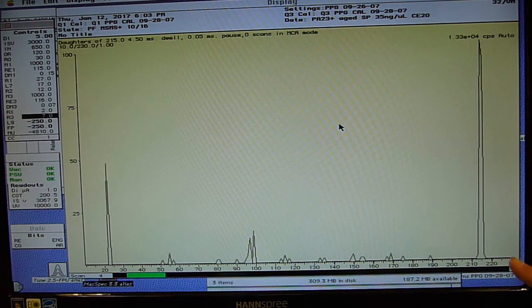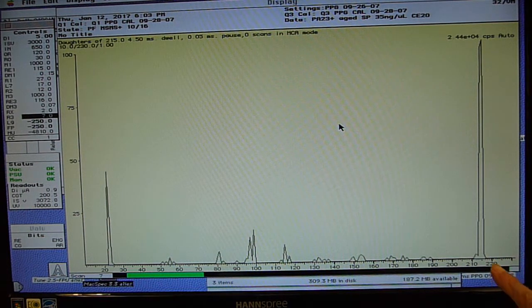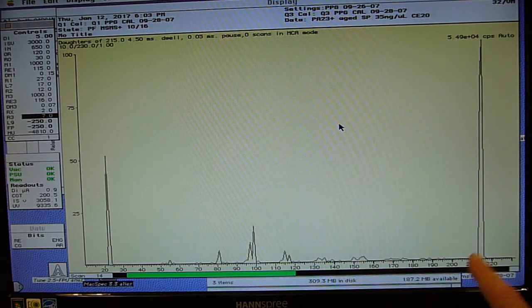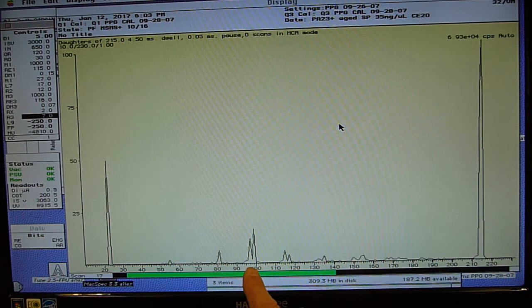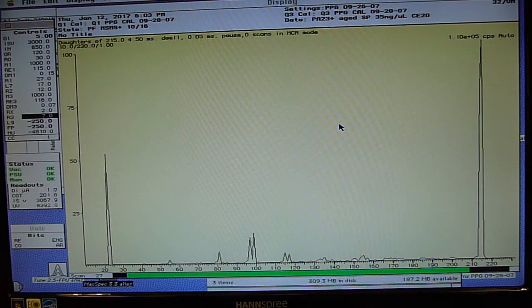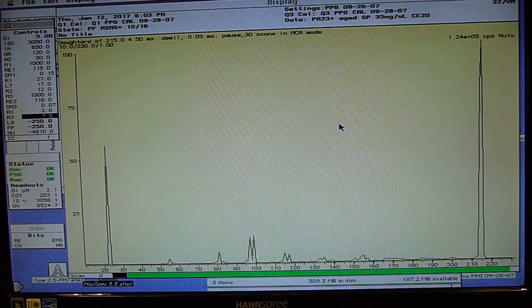And you can see, this is a collision energy 15 eV. So we still get some 215 through there. And then these are some fragments of the 215. And then one of them has the sodium. If sodium ion is in that ion with the rest of the carbon, nitrogen, oxygen, sulfur, it's nice to see that the sodium, when it gets broken down, is still there.